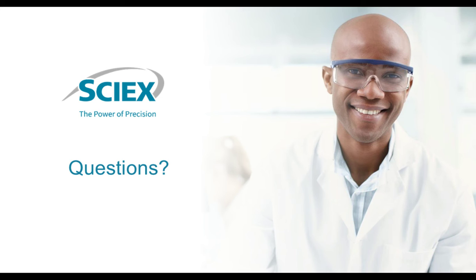Okay, let's get started. We've already got some great questions coming in. Handy, let's start with this one. When creating an instrument method with UV wavelengths, it is only possible when connected to the CE instrument. Is this still the case with version 1.3? Yeah, that's a good question. In version 1.3, the CE instrument does not need to be connected for you to create an instrument method with the UV wavelength.